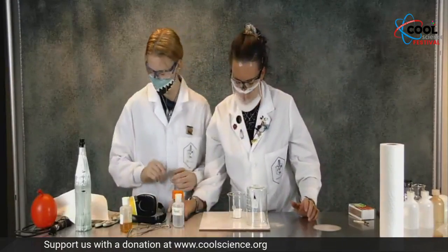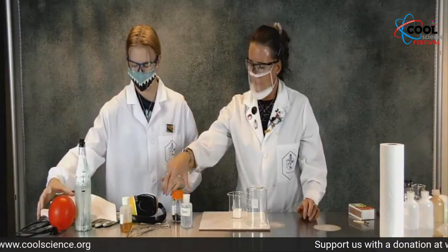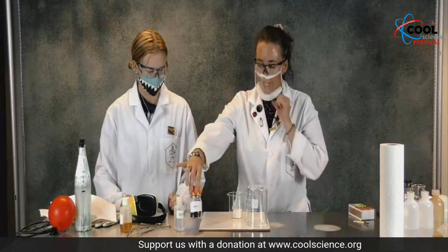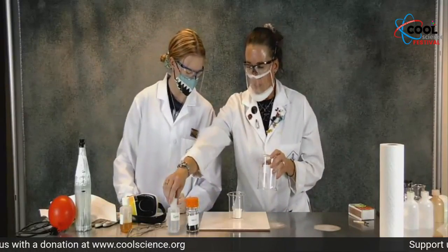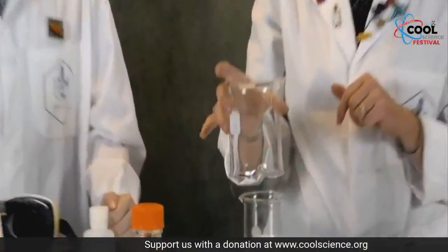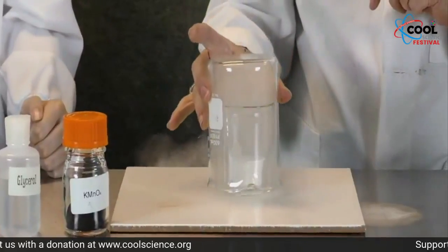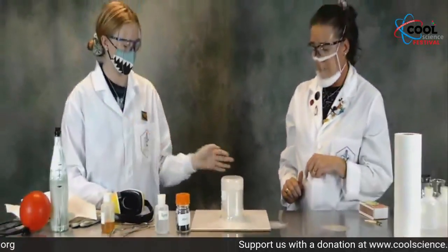No, it's all good. So what we have here is a substance called glycerol. What we have here is potassium permanganate. The potassium permanganate has the oxygen built into it, if you can see the formula. And the glycerol is going to provide the fuel. So we have a fuel and we have an oxidizer. And you can see it's starting to smoke. And I'm going to cover this to contain that smoke a little bit. And as it keeps going, it's actually going to ignite.